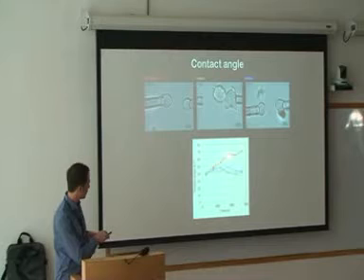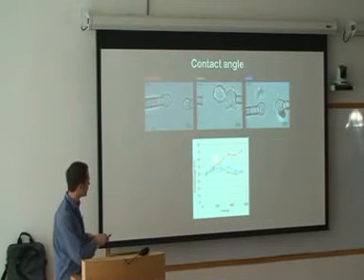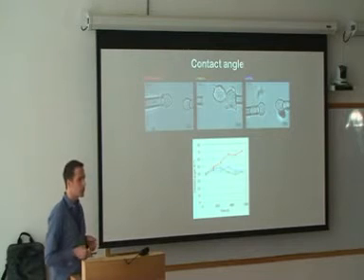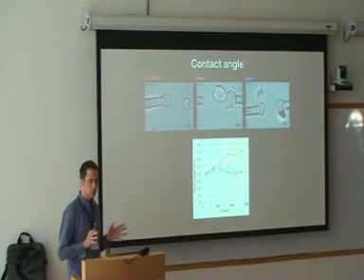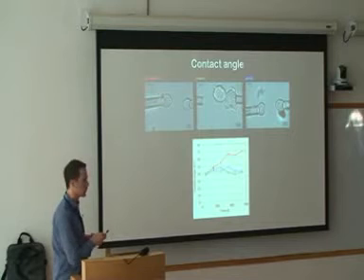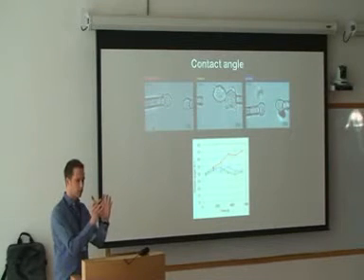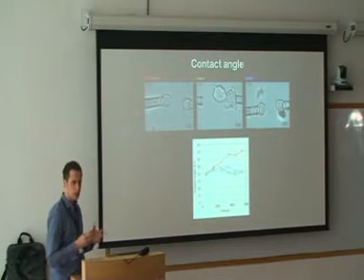So when we're looking at these contacts and the contact angle, what we're finding is that ectoderm doublets increase their contact area over contact time, which ranges from 1 minute up to 10 minutes, and it goes into something which looks like steady state. It's not really steady state, but I think they're stabilizing the contact size at this stage. If you compare that to mesoderm and endoderm, they're forming significantly smaller contacts. This is consistent with our surface tension measurements on these multicellular aggregates, saying that ectoderm has a higher surface tension, so the doublets form a larger contact area because they're trying to round up, and mesoderm and endoderm cells form a smaller contact area because they have a lower surface tension.